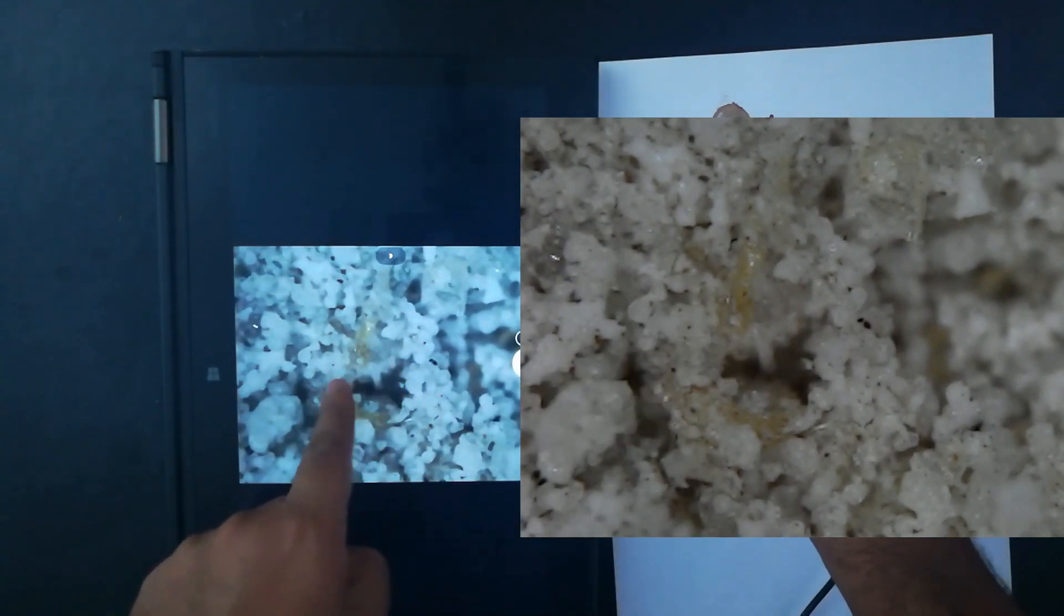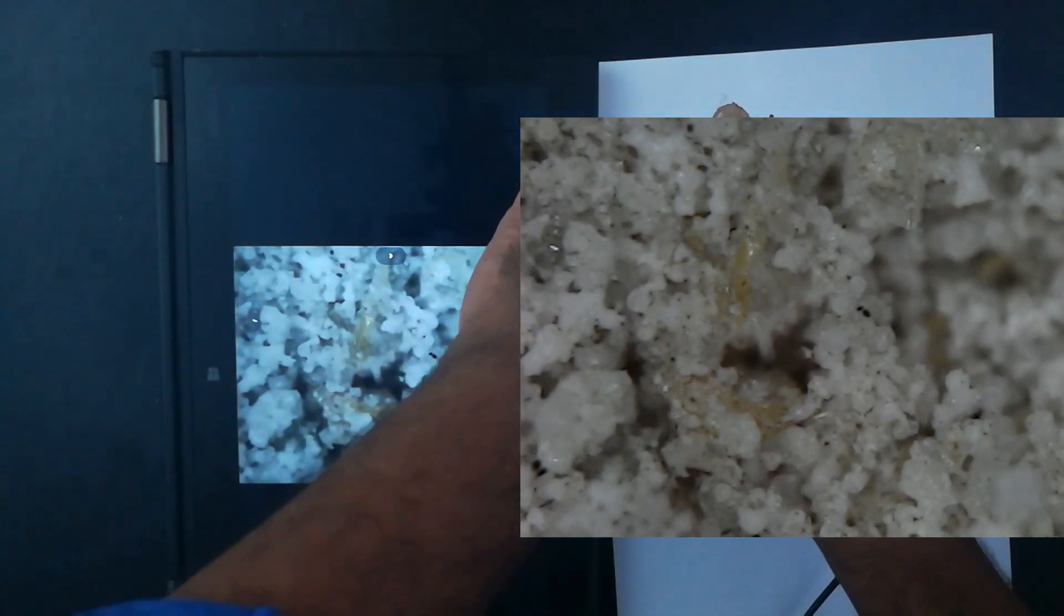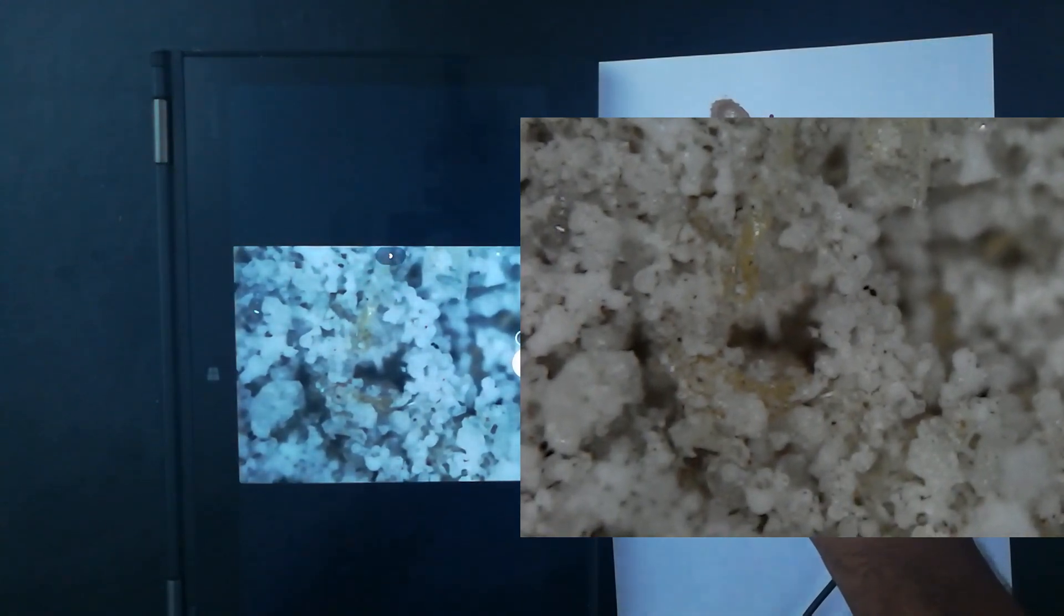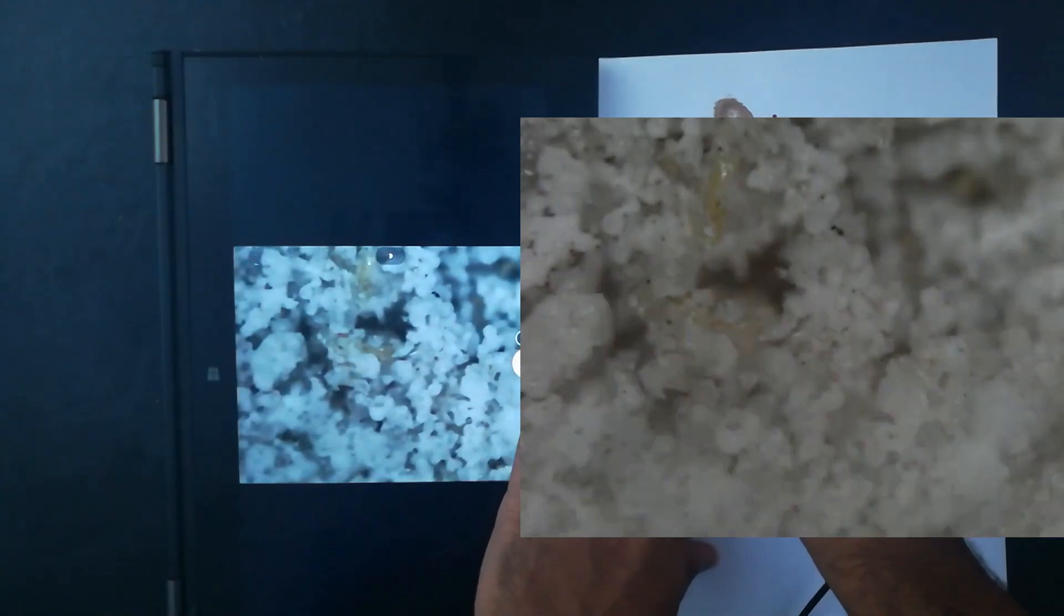Yes. A wee bit better. If you see the granules that are around this thing, these are like the whey or something that we saw previously in this MyProtein, As It Is Protein and Nutrimed Protein. But this thing is entirely different. See, I'll just repeat. This one is Muscle Blaze Beginner's Whey and it's got all these bunch of things. If I just move on to As It Is, quickly, quick and dirty, and do the focus action there. See, there's not much. It's just very simple stuff.